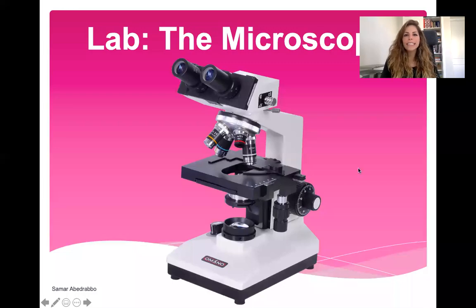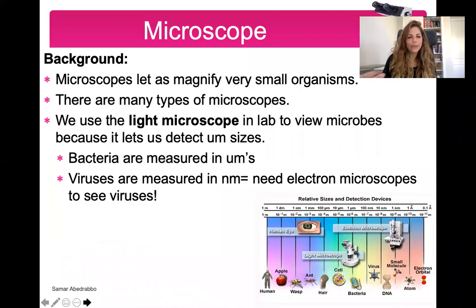Hi everyone, this lab is about the microscope, so it's going to teach the basic components of the microscope, and it's very similar to what I covered in the microscope and staining overview lesson, so a lot of it is repetitive if you did see that. But it's a good review.